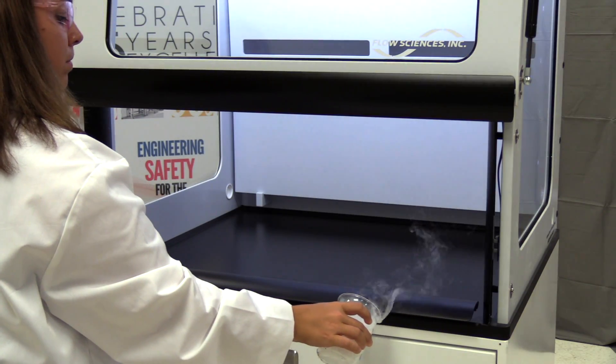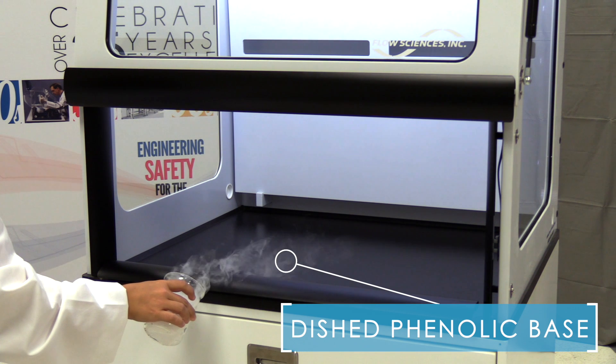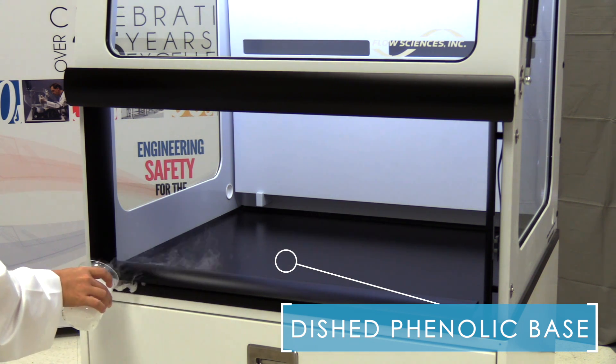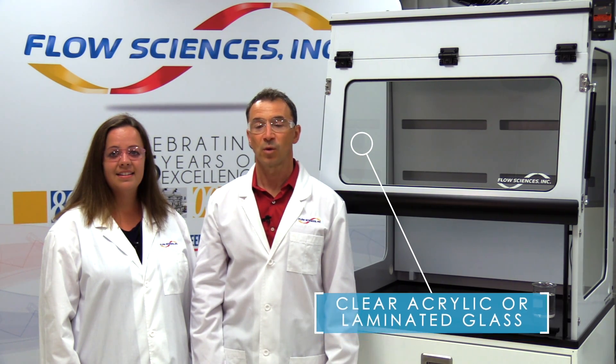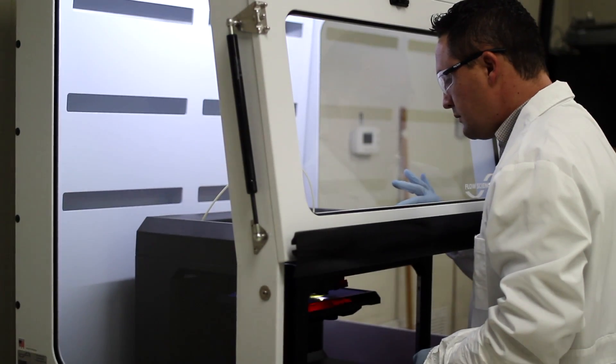The chemically resistant phenolic base is dished to contain spills and coated to protect the work surface from harmful chemicals. The unit also features clear acrylic or laminated glass panels, as well as LED lighting to maximize visibility.